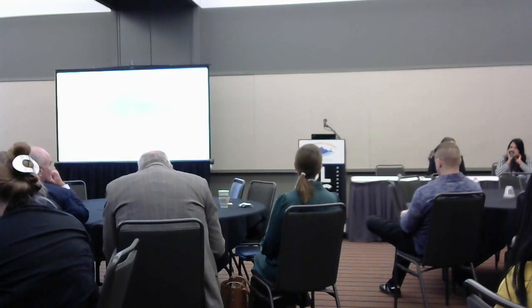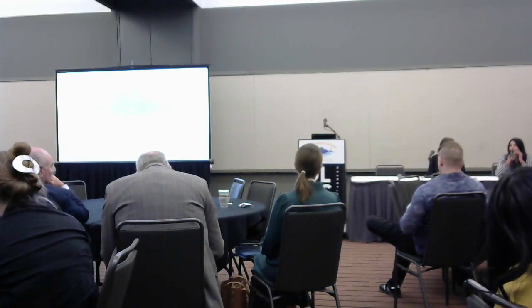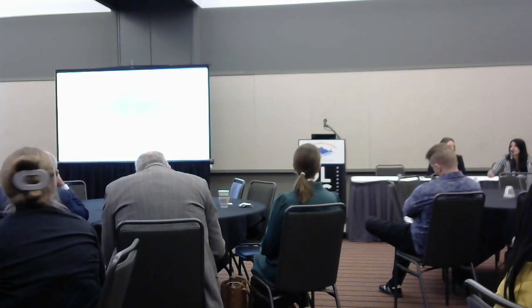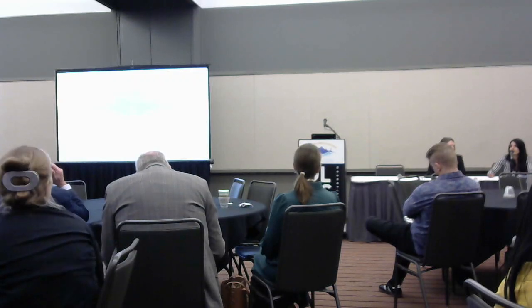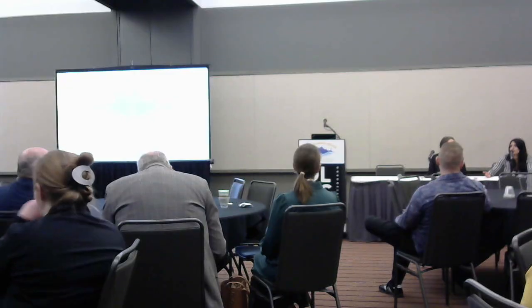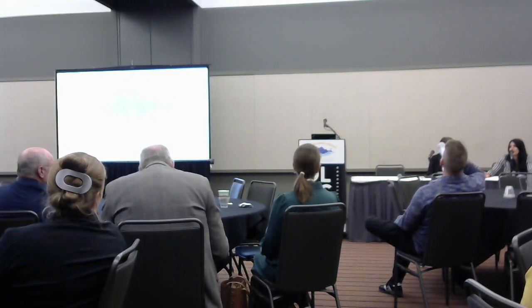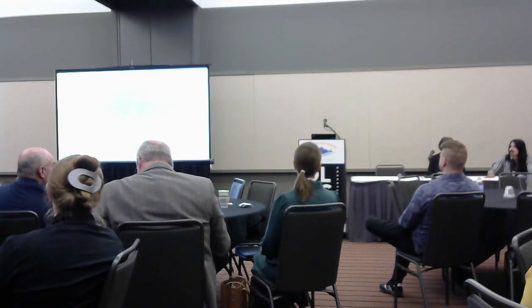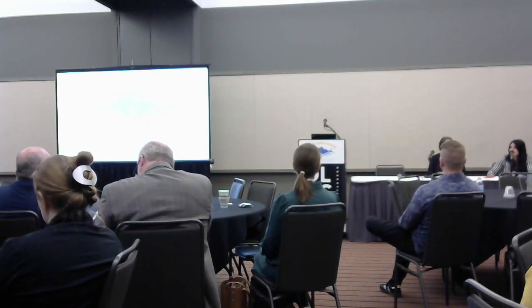What we are trying to do is that whenever we do image consultations, we try to address their most immediate image analysis needs and how they think about scaling this also. So if they are thinking about starting with an Imaris pipeline, but they know that in 3 months they would want to do this for 500 images, we urge or encourage them to think about maybe some other pathways. Yeah, did that answer your question?